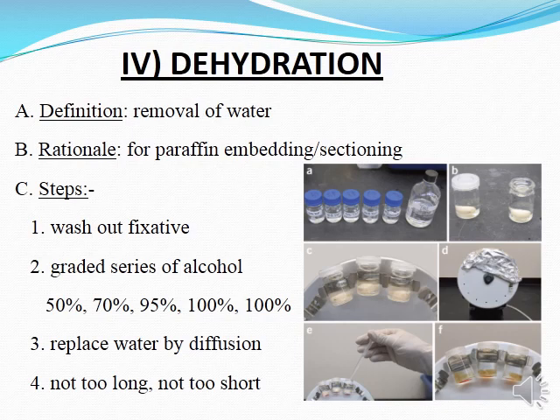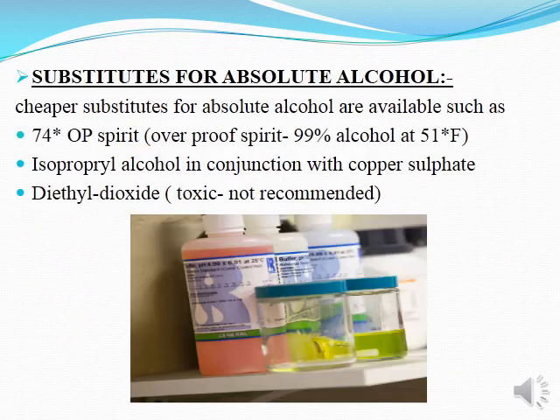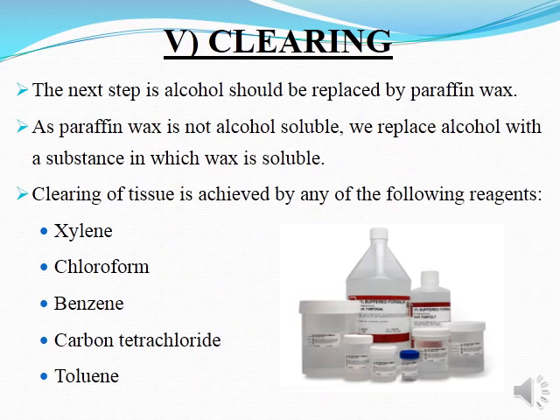Dehydration is the removal of water. The rationale is for paraffin embedding and sectioning steps. Wash out the fixative through a graded series of alcohol, replacing the water by diffusion. Next, usually we use absolute alcohol, otherwise spirit or isopropyl alcohol or diethylene dioxide.